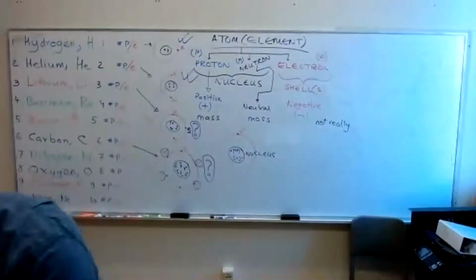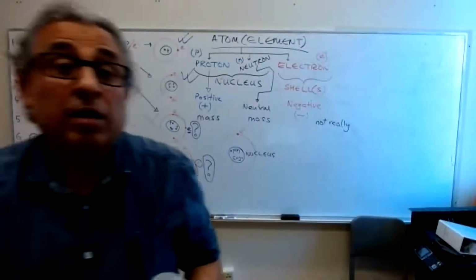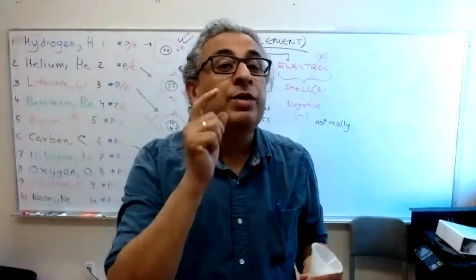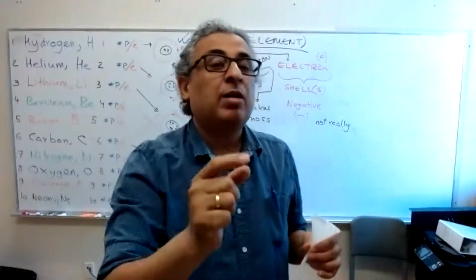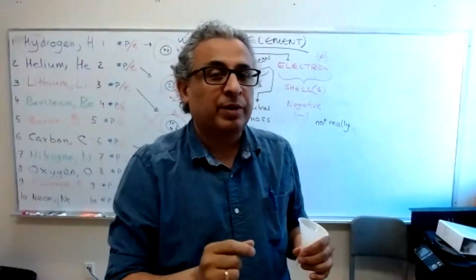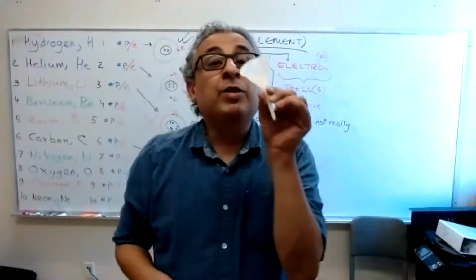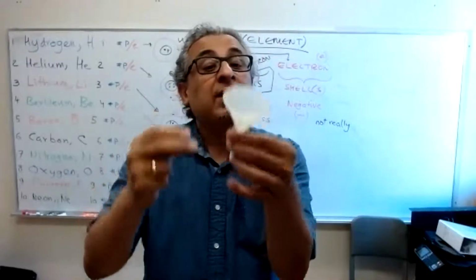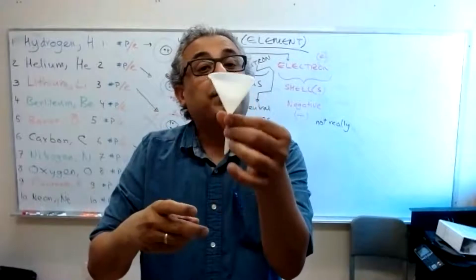So those vacuum filtration devices are for the situation when you need the solid and don't care about the liquid, the supernatant liquid, the filtrate. When you need the liquid and don't care about the solid, then you use a regular filter funnel.